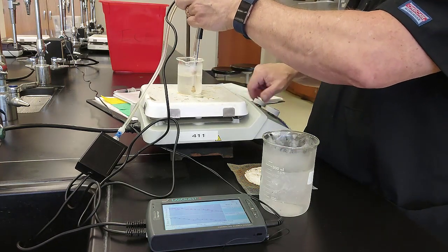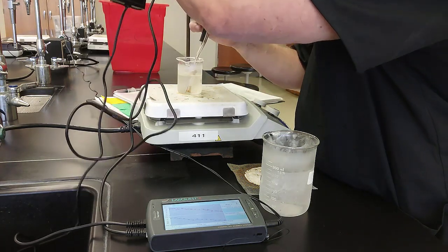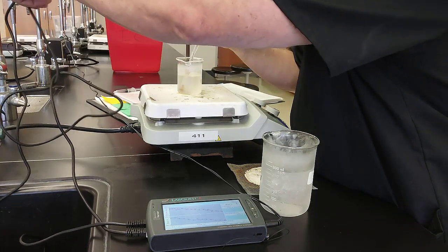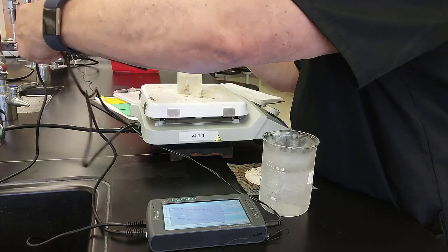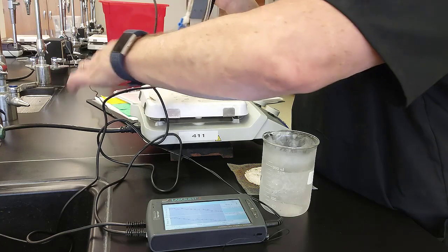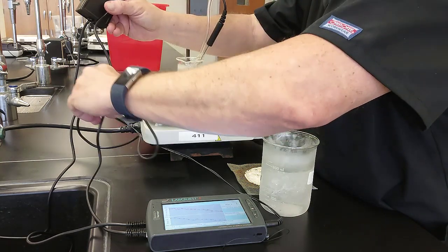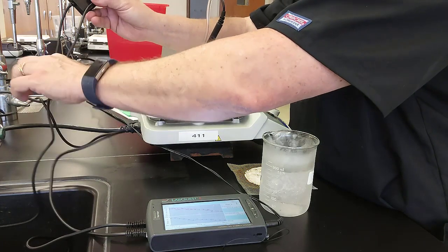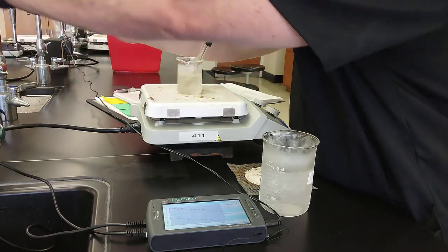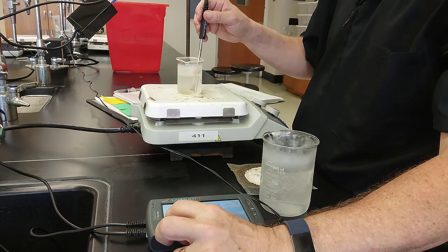Now I'm going to switch onto the hot plate, and I'm just going to crank the hot plate to super hot. I'm going to carefully drape my power cord and my other cords over a clamp attached to my hot plate. I'm going to put these other cords also draped over the sink so that I don't burn anything. And I'm going to hit run again.